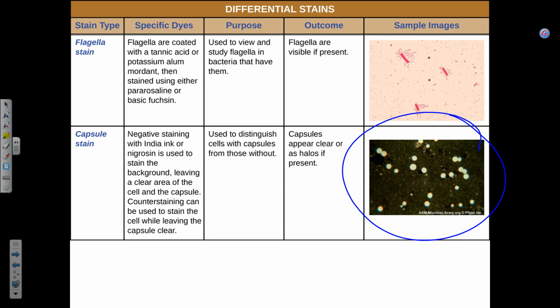God forbid, no. But I can give you an actual example: such and such dye penetrates and is retained by the walls of Mycobacterium tuberculosis. Would it be an example of Gram staining, acid-fast, and so on? So you have to know the purpose of the staining rather than all those chemicals. Did I make myself clear about that? Okay. Any questions on the staining?